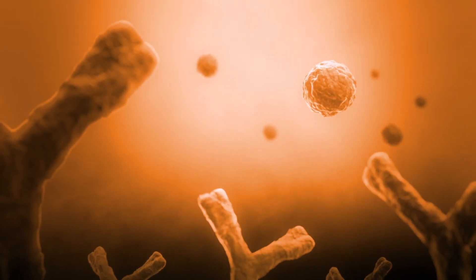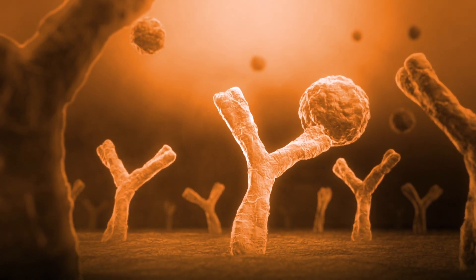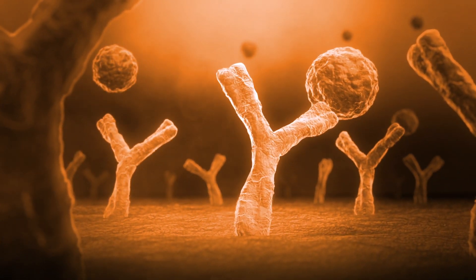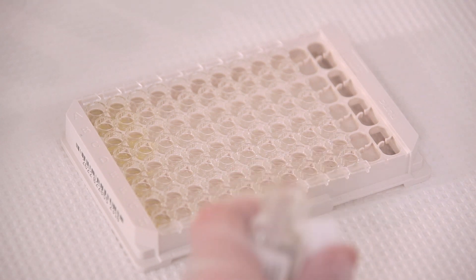Once the first incubation starts, insulin in the calibrators, controls, and samples will bind to the monoclonal capture antibody that is bound to the ELISA plate wells. The calibrators are yellow and can be seen clearly in the wells.